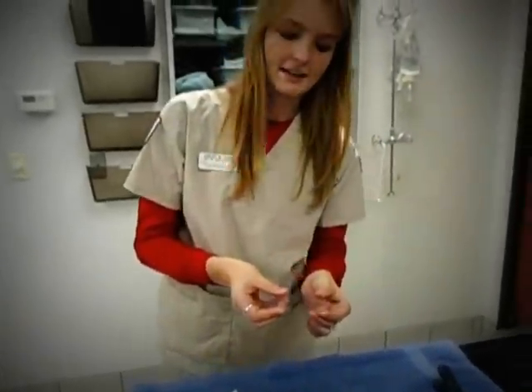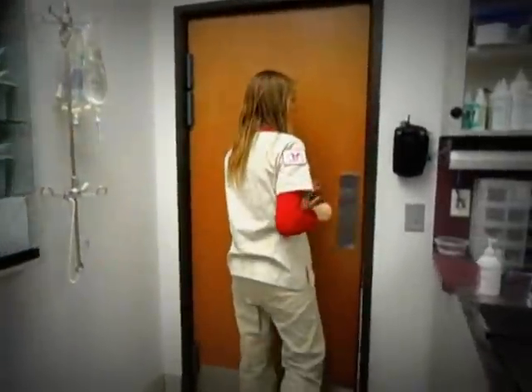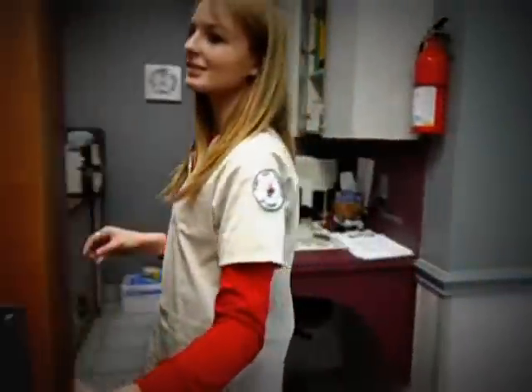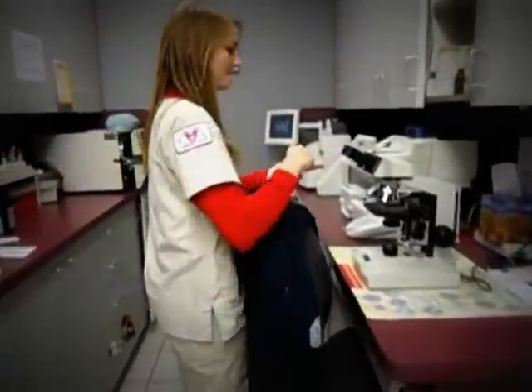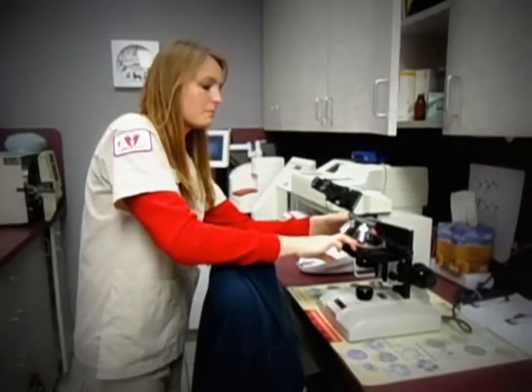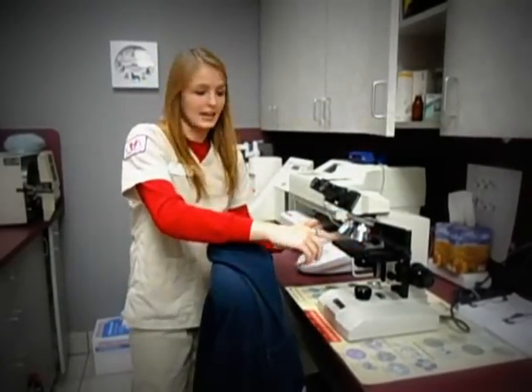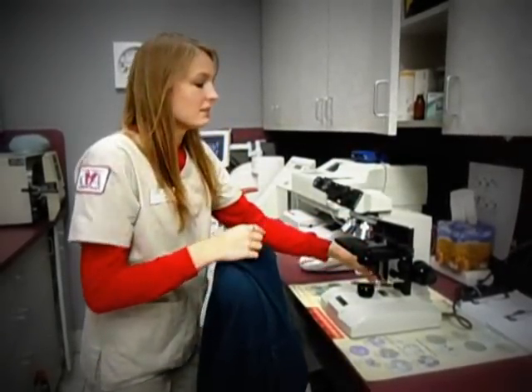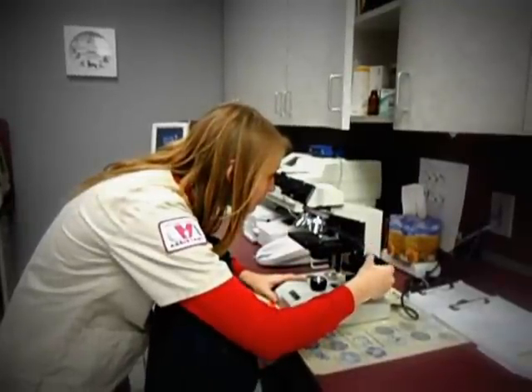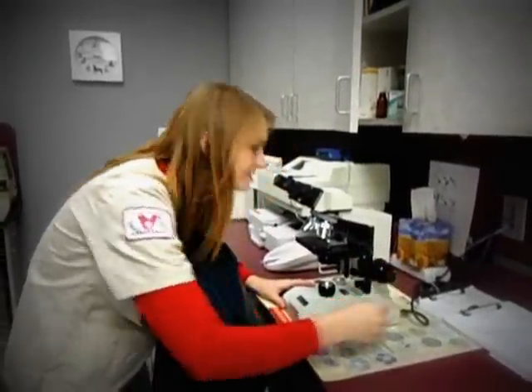Now I take my slide over to the lab area where my microscope is. I place my slide, making sure that the left ear is on the left side and the right ear is on the right side. I turn the microscope on, focus it on low power, and now I go tell the doctor that the slide is ready.